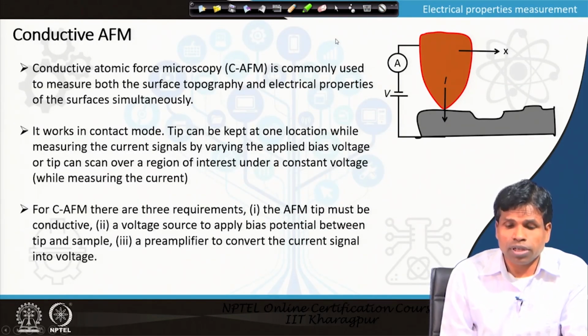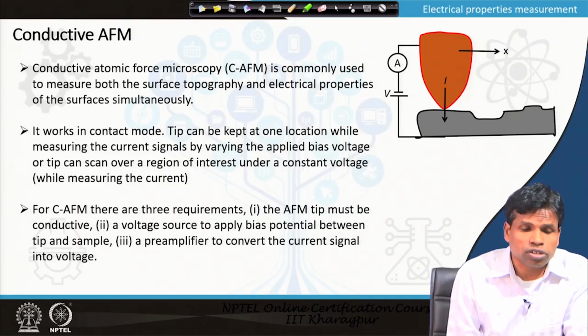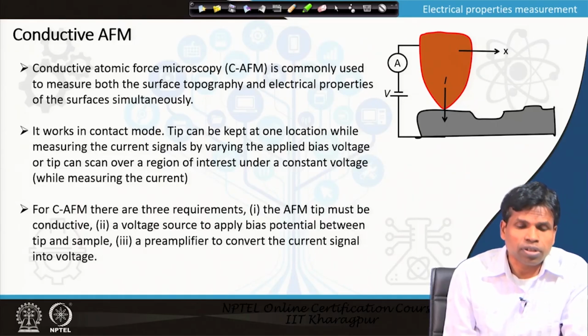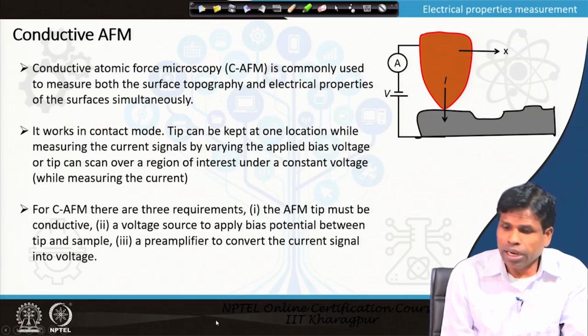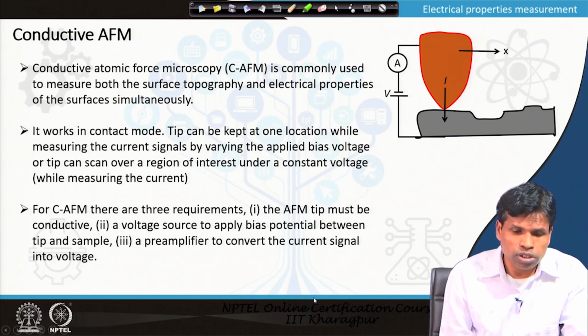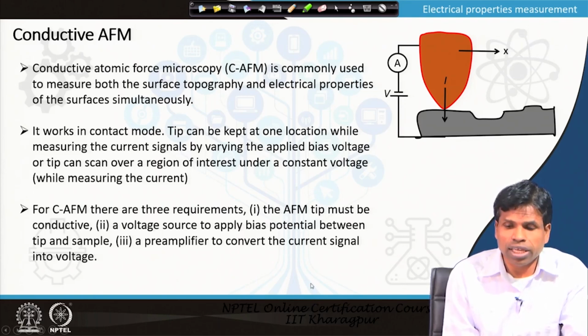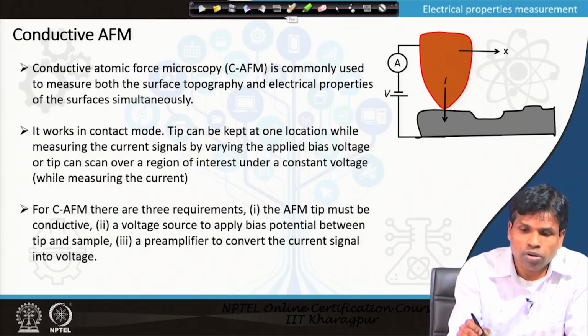Another microscopy is the conductive AFM. Here, as the name suggests, the tip has to be conducting, and when a conductive tip is brought close to the sample surface, then we can also study the electrical properties of the sample. So, it works in the contact mode operation.